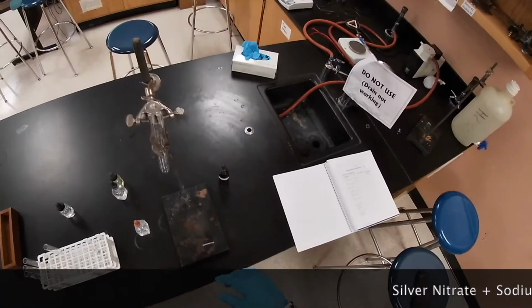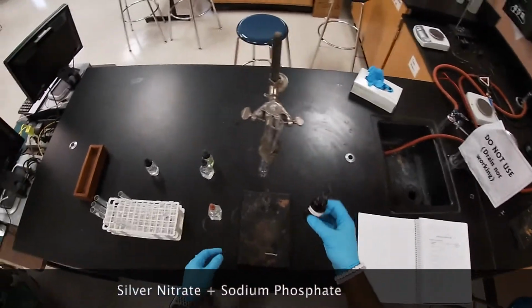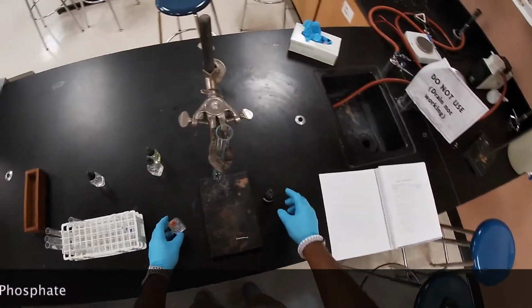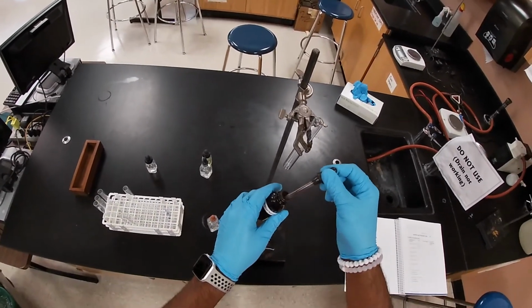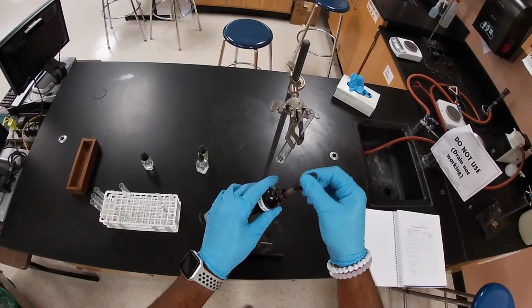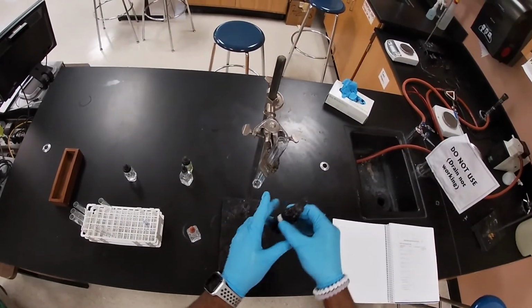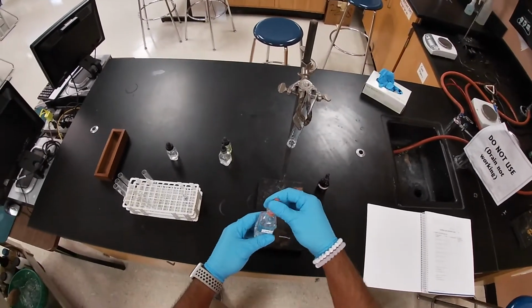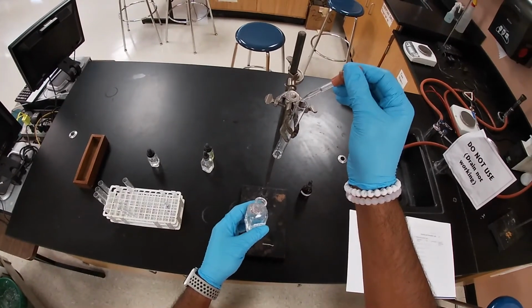The next reaction is going to be between silver nitrate again, and this time we're going to react it with sodium phosphate. So silver nitrate and sodium phosphate. We're going to get our dropper full and a test tube. Now we've added our silver nitrate into our test tube. We're going to get some sodium phosphate and add a few drops.